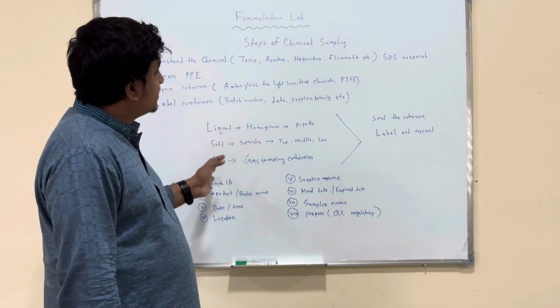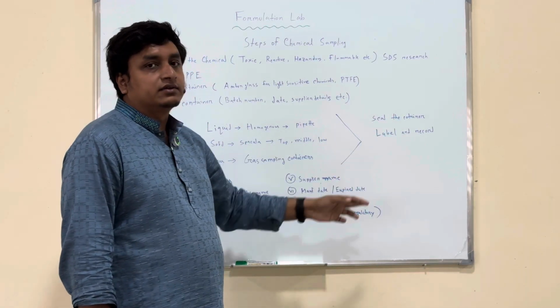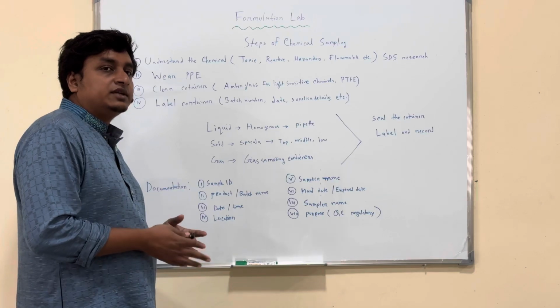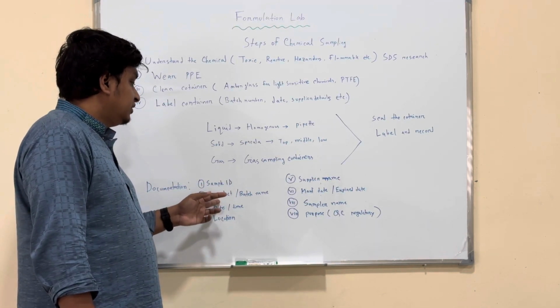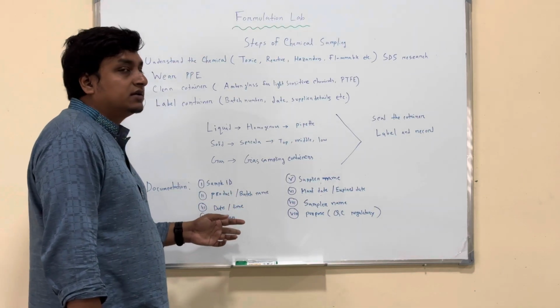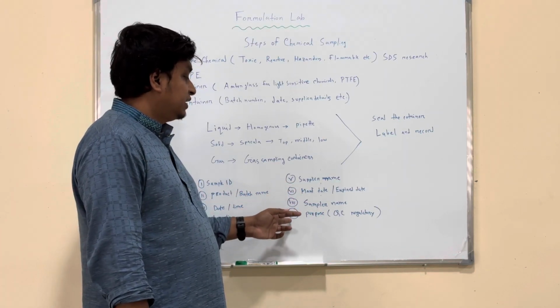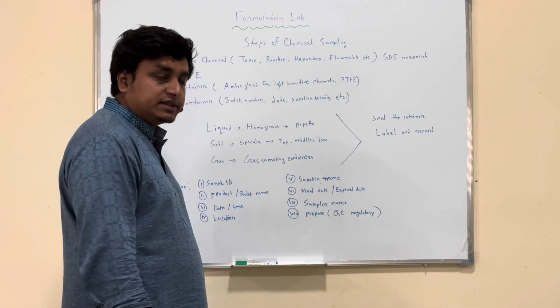So after collecting the samples, we need to seal the containers, label and record them. And finally, the documentation. What kind of documentation should we maintain for this chemical sample? Like sample ID, product or batch name, date and time, location, the supplier name, manufacture date or expiry date, and the purpose. It's for QC and regulatory purposes.